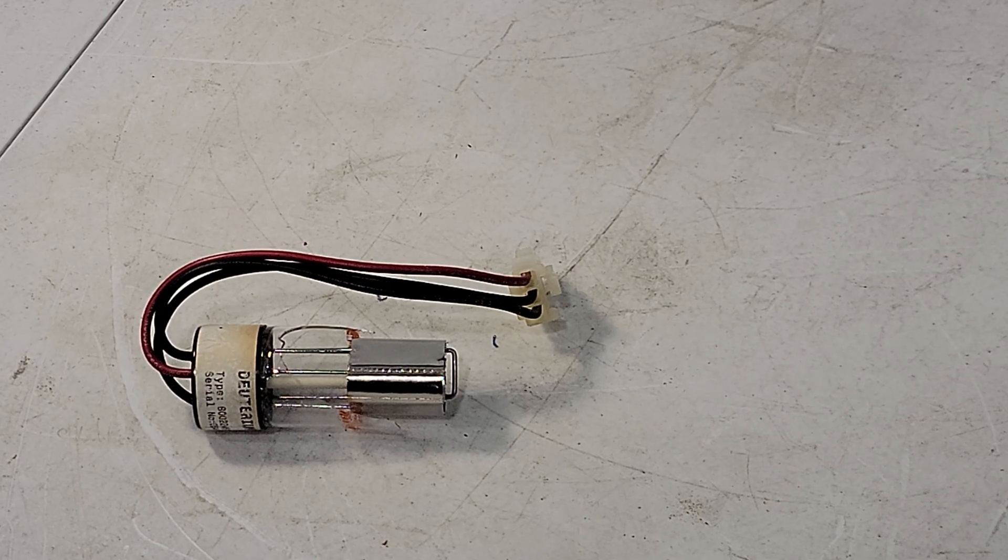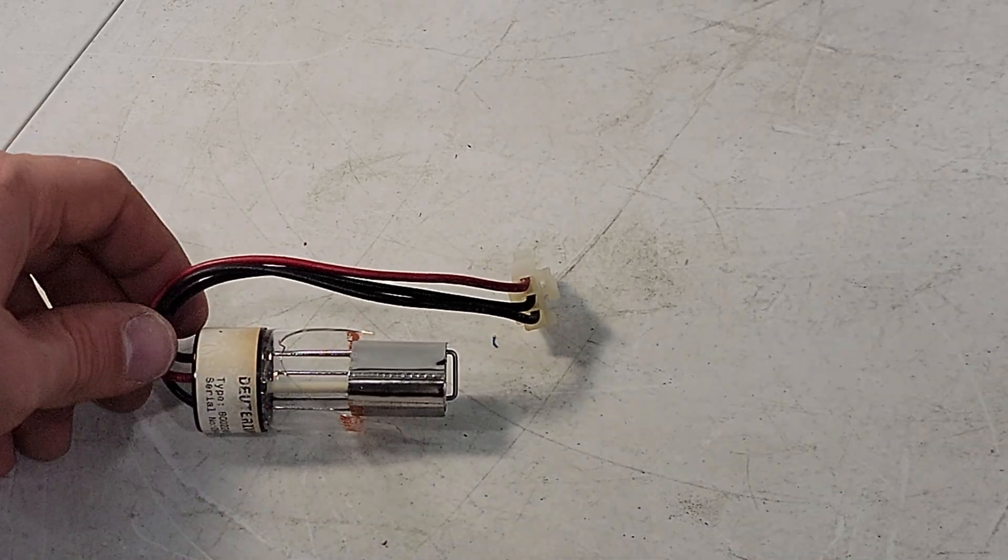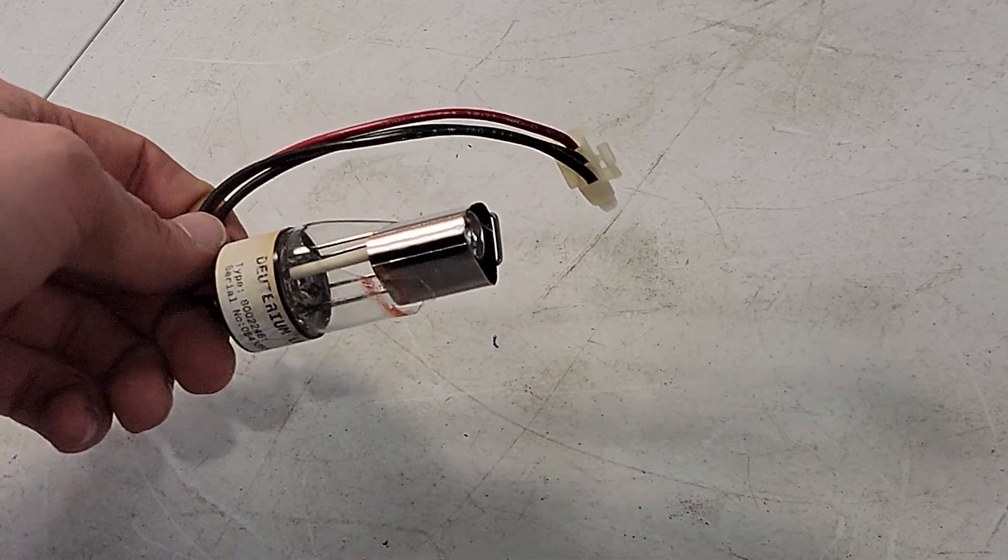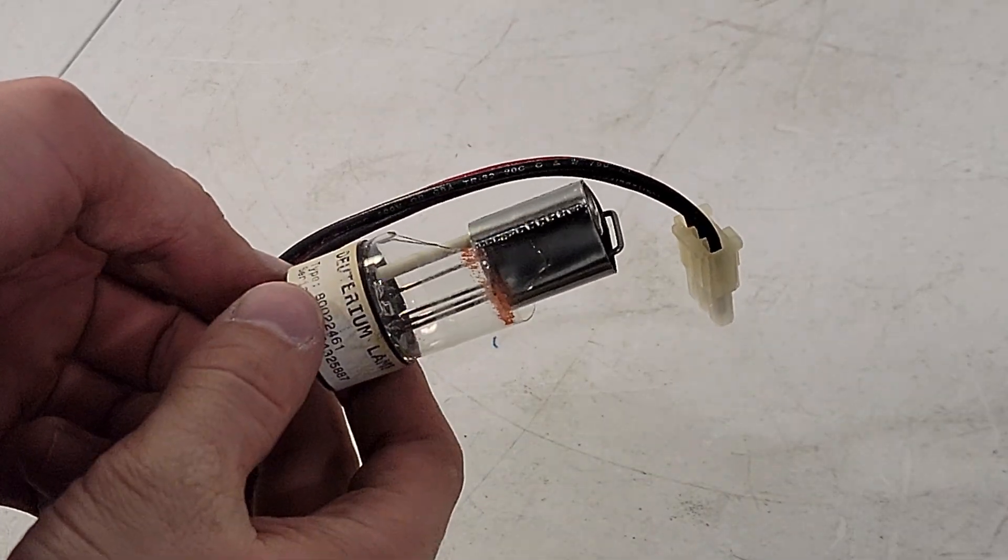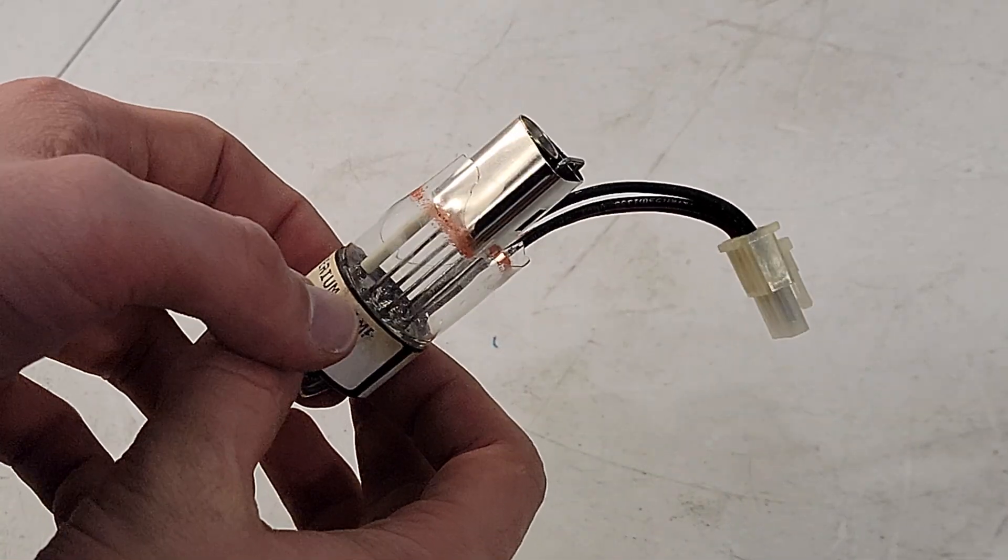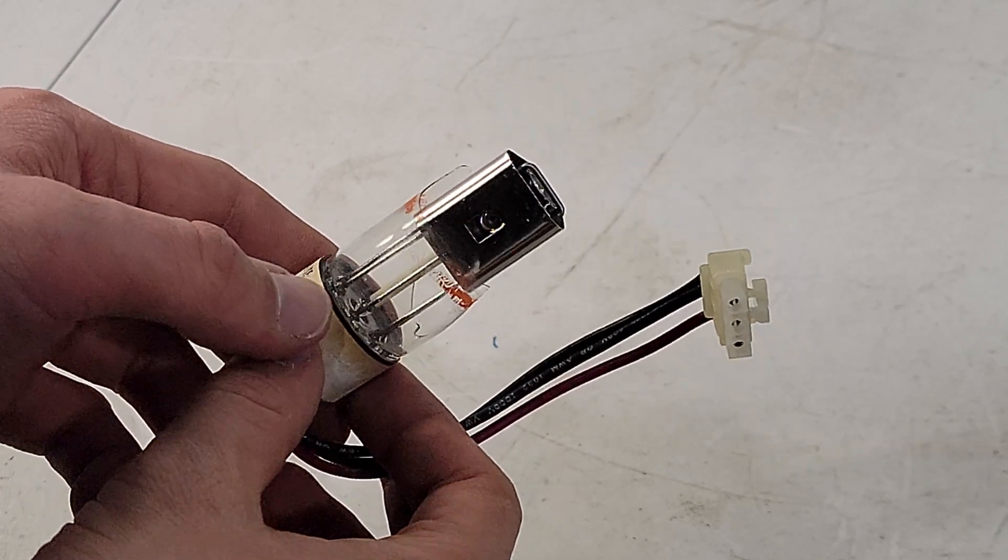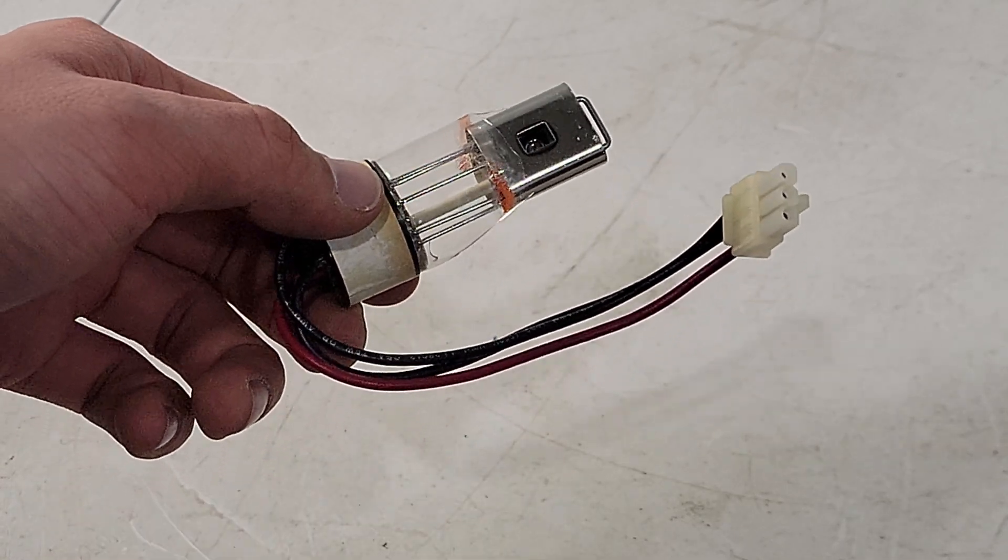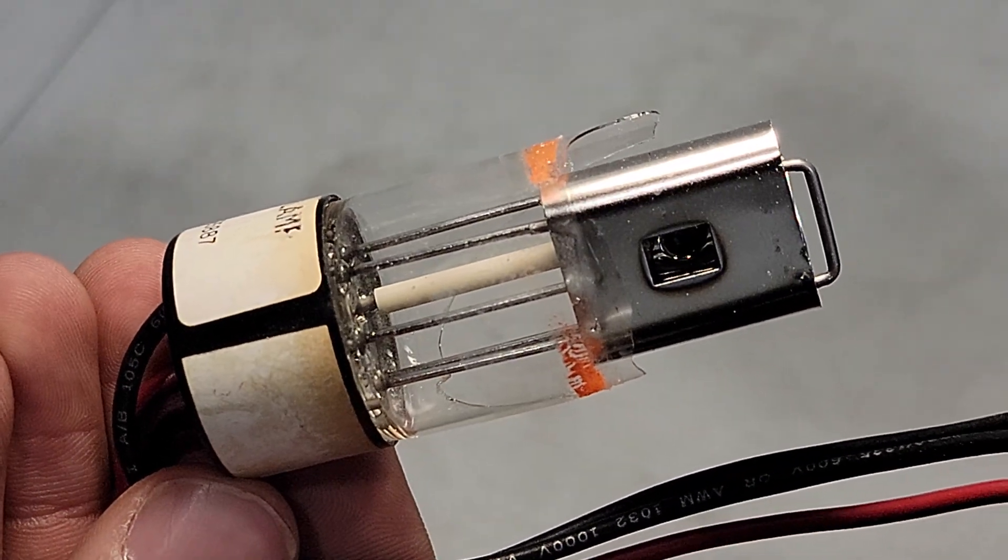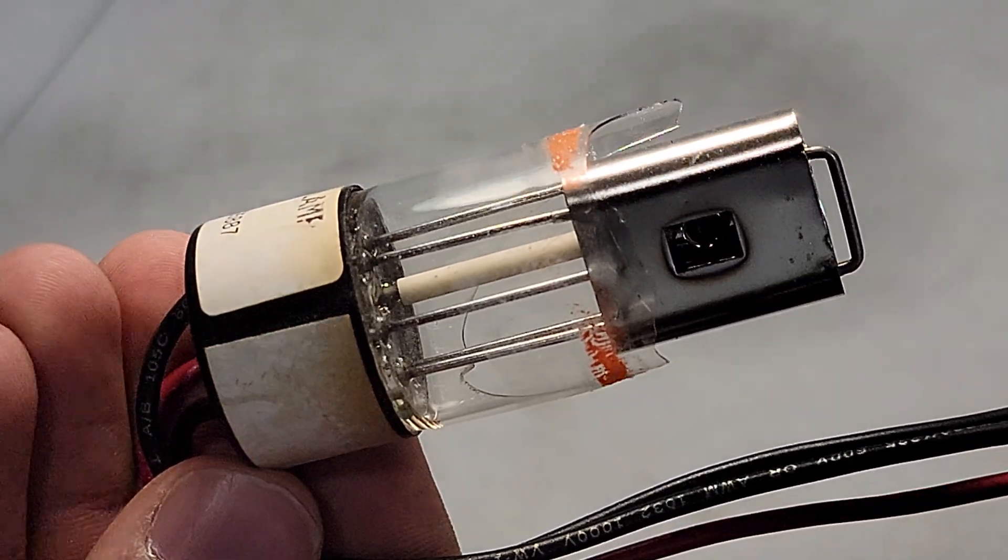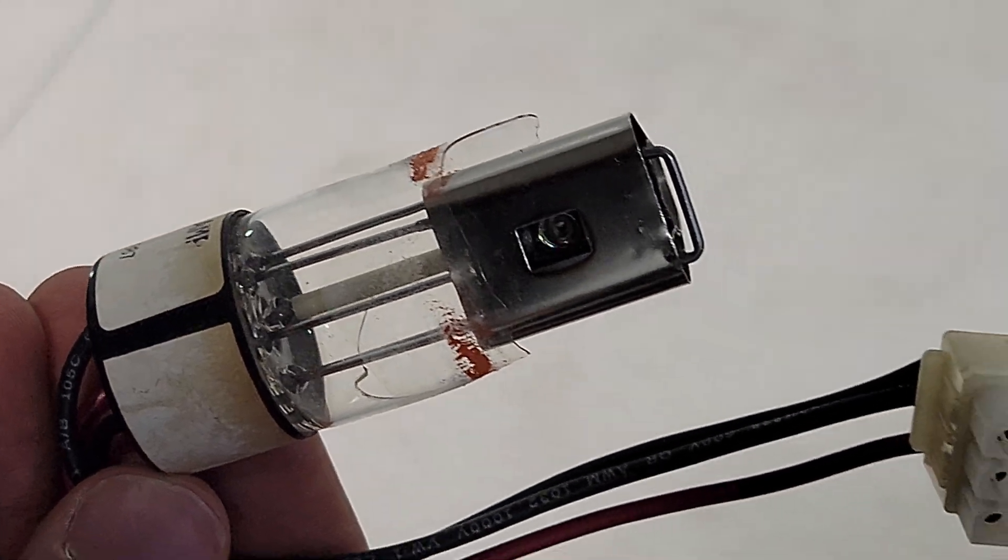Now, because normal glass blocks most of the UV light spectrum, these lamps are almost always encased in quartz. The quartz keeps all of the deuterium gas trapped in a lamp where the arc can excite the molecules into a higher energy state. As the molecules relax back down, they emit photons of light, which create the emission spectrum of the lamp.